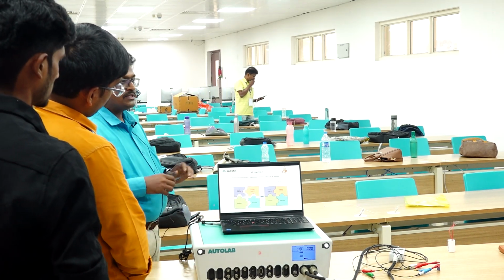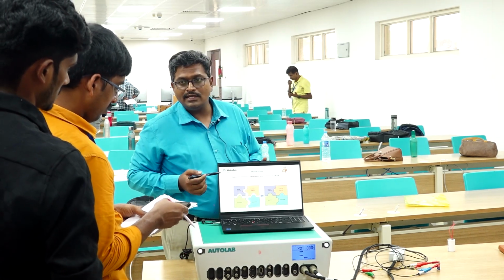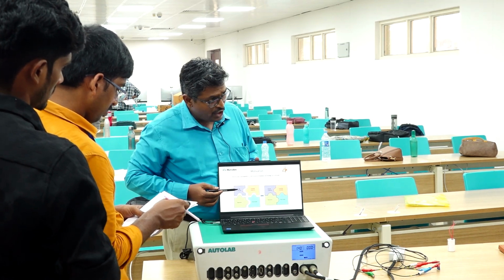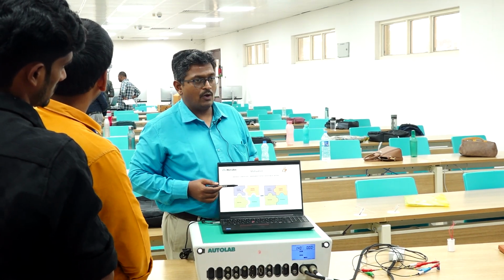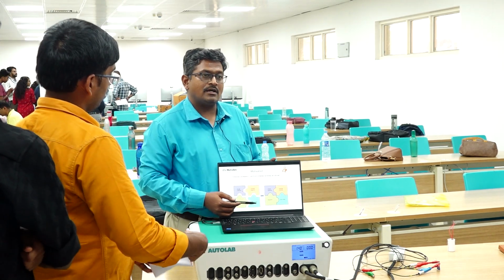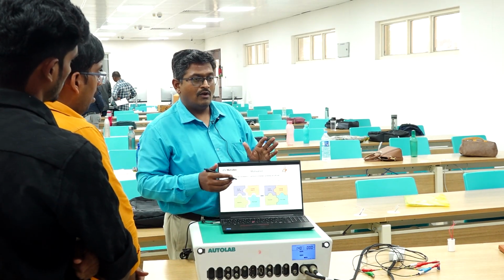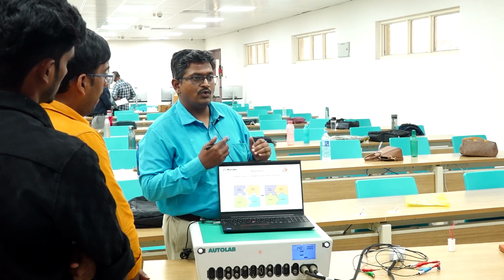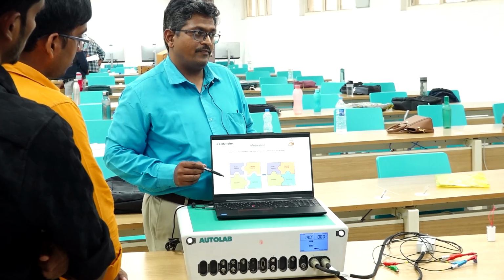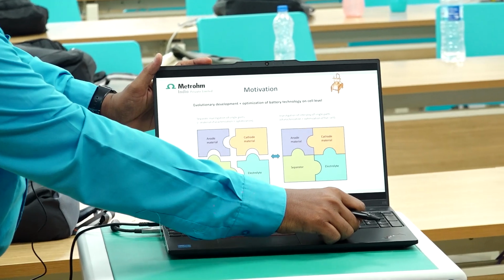So in battery, how is this equipment going to be useful for you? A few slides back, we have seen a battery consists of anode, cathode, separator as well as electrolyte. You can do individual characterization of your anode material, cathode material, how my electrolyte is behaving, how my separator material is behaving. You can study individually when you are doing research. Once you have developed your battery, or you want to do reverse mechanism studies, in the full cell also you can do the complete characterization. In this way, this equipment is going to be useful for your battery research.